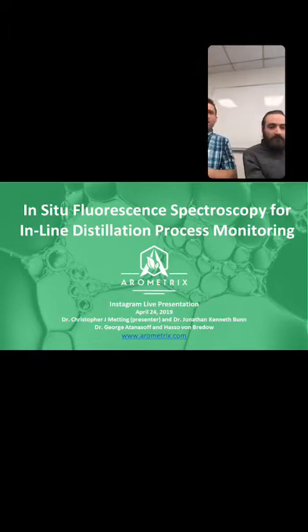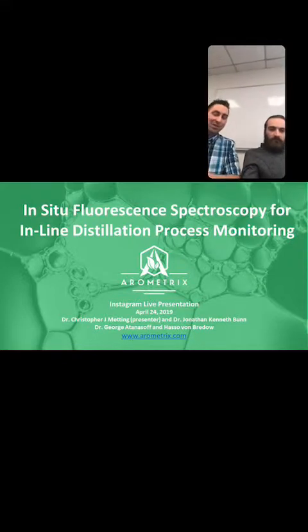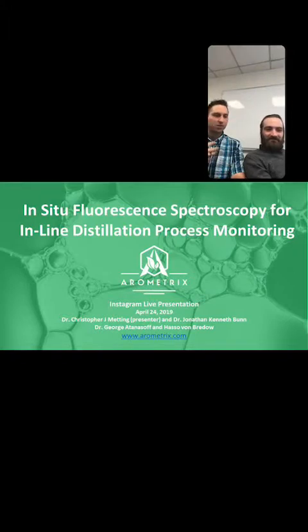All right, so like Kenneth said, we're going to be talking to you about the work we've been doing in situ fluorescence spectroscopy as a tool for inline monitoring of the distillation of cannabinoids. So we gave this presentation at the Cannabis Science Conference. As was noted, we took Ricky Lake's spot. And so what we're doing is just giving a bigger forum for this same presentation that we gave so that more people could have access to it.